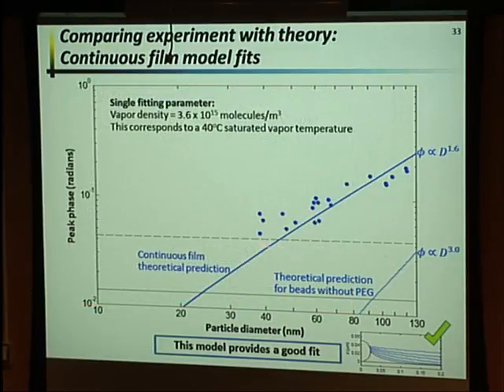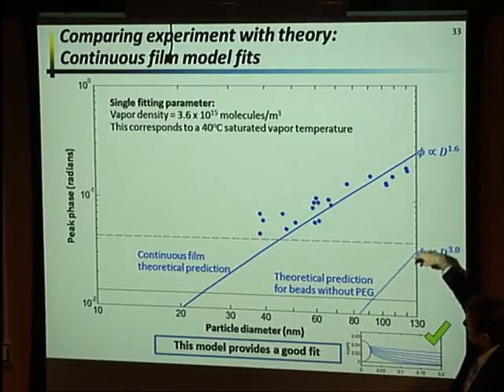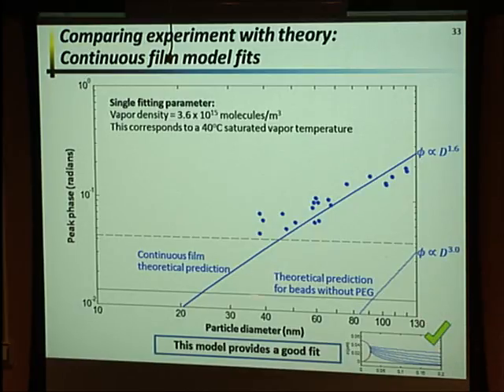One interesting thing to note is that once we add the nanolens, the scaling is a little bit different. It's no longer d cubed, and we've actually pulled this curve. You can think of it as the scaling relaxes, and this angle comes up. One thing I should have mentioned is this is plotted on a log-log plot, so any of these scaling parameters end up as lines. So d cubed is the slope of this line. In that case, the 1.6 is the slope of this line on a log-log plot. By pulling this line up over here, by reducing its slope, we can actually image these small particles above our detection threshold. This lower line is about the noise level of our image sensor, and this is then three times the noise level, which is what we're using as our practical detection threshold.